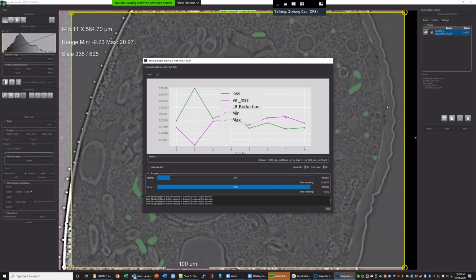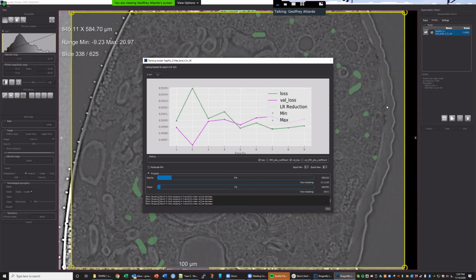I thought there was a 3D UNet. Yes, we actually have two versions. One is what I just said, multi-slice. We call it 2.5D, but it shows as 3D when you choose it in Segmentation Wizard or in the deep learning tools. When you create a UNet, you see 2D or 3D.